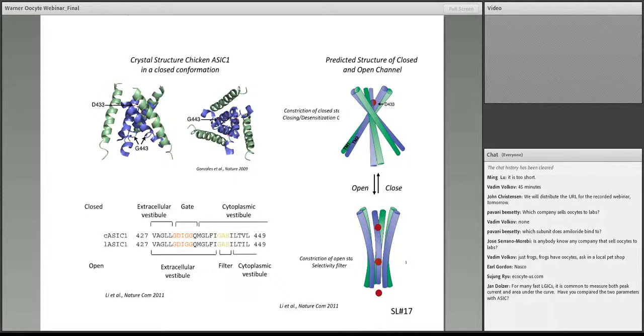Now, let's change gears and present some data of a transporter. In this case, it is the sodium iodide symporter, also known as NIS, that was originally cloned using a functional assay in Xenopus oocytes by Dr. Nancy Carrasco. This molecule is found in the basolateral side of the epithelial cells that form the thyroid gland, where it transports one iodine ion and two sodium ions from blood into the gland. Thus, it generates an inward current.